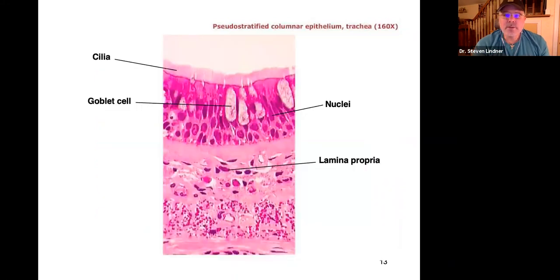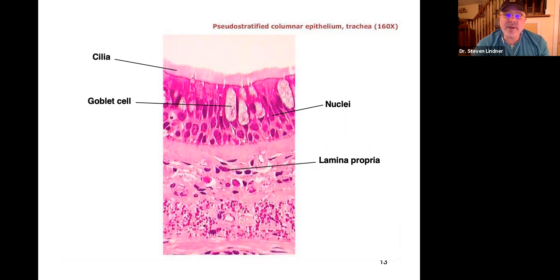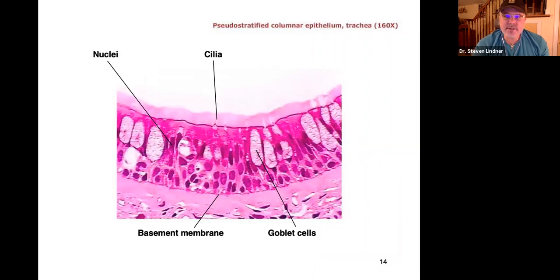Here's another view of the trachea. These are columnar cells with nuclei at different levels — you'd want to say stratified columnar, but we know there's no such thing, so it's pseudo-stratified columnar epithelium. Again, you've got cilia, goblet cells producing mucus, and columnar cells with nuclei at varying levels: pseudo-stratified ciliated columnar epithelium of the trachea.